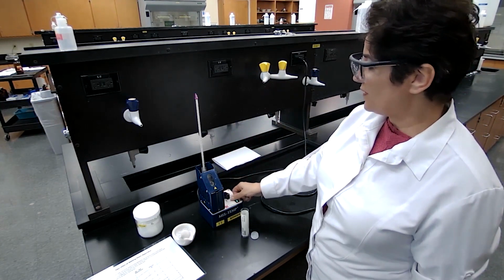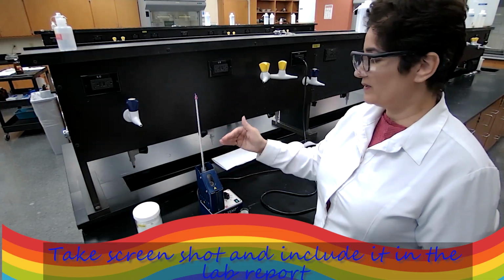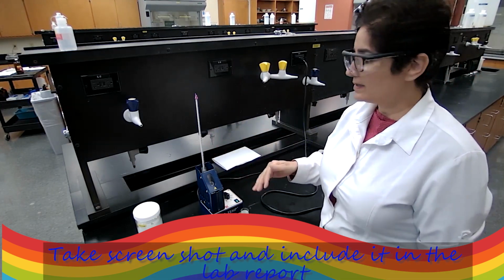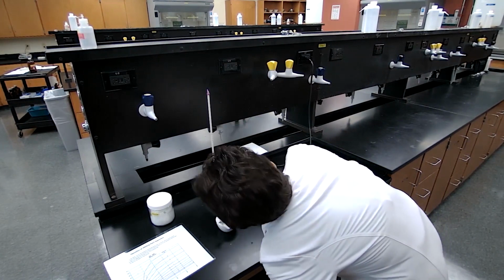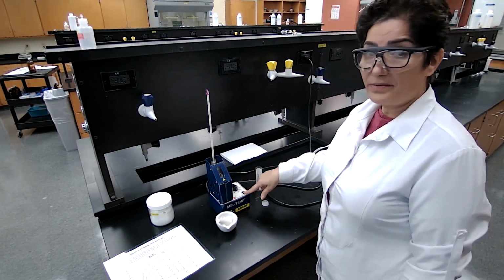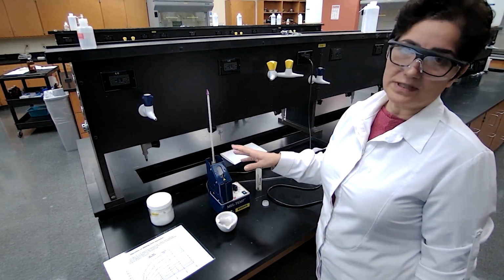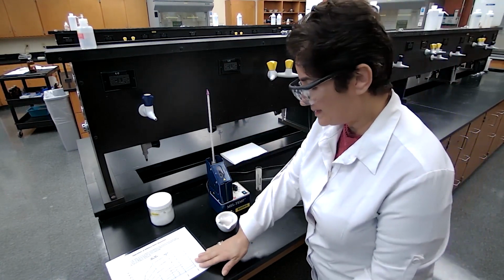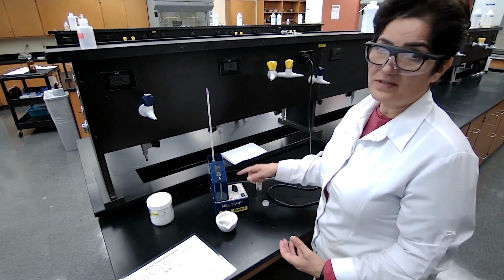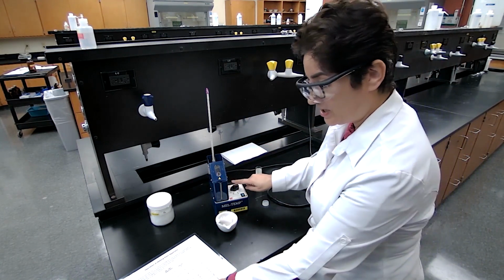This one is set at 4 or 5, and if it melts at less than 100, I have to adjust. If it melts over 100, over 150, I have to adjust. The temperature is 46 and it is already melted. So whatever it is, the melting point of this sample is less than 46. And because it's less than 46, setting the power regulator between 4 and 5 is very fast heating. I need to lower and adjust this.